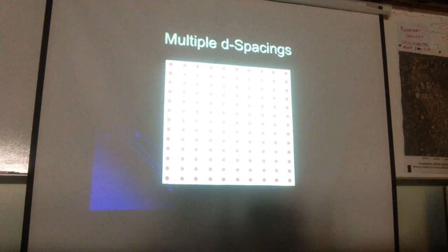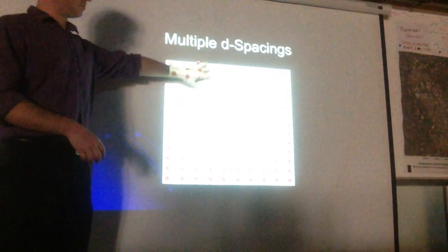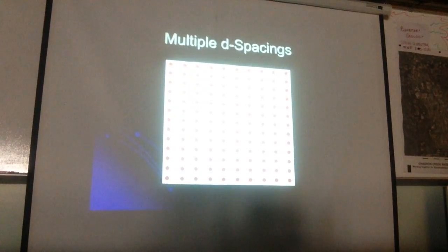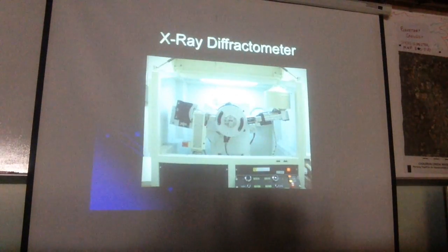Because in order to get good intensities for all your peaks, you want the minerals that you ground up in your sample tray to be in all different orientations, so that the X-rays, when they pass through it, give you a complete picture of what mineral you're dealing with, or minerals as it may be.